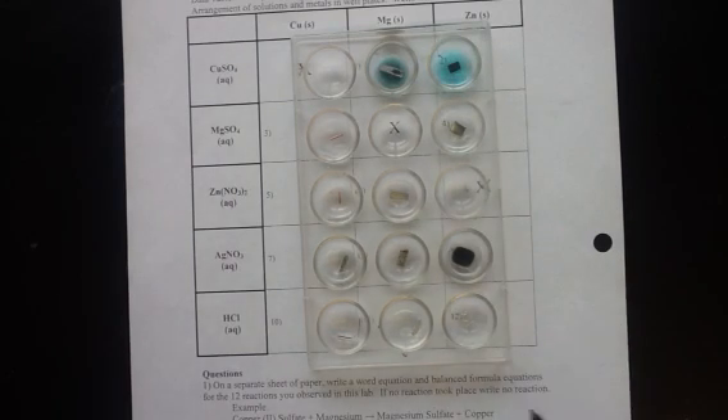Using this information you should be able to write balanced equations for the single replacement reactions that took place. Then you should be able to put copper, magnesium, zinc, silver, and hydrogen in order from most reactive to least reactive as they appear on the activity series.